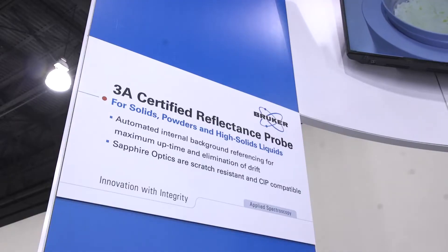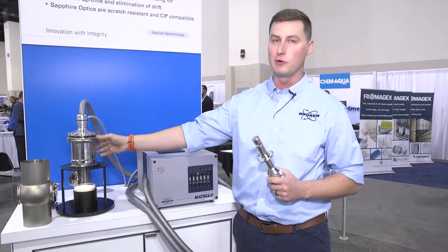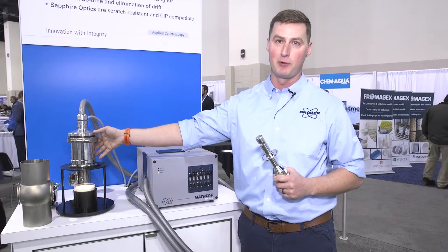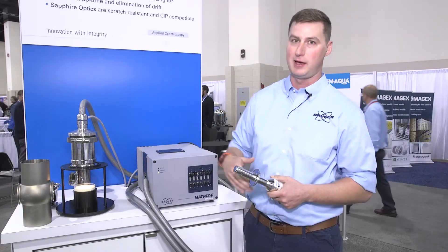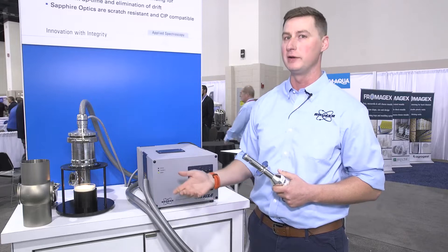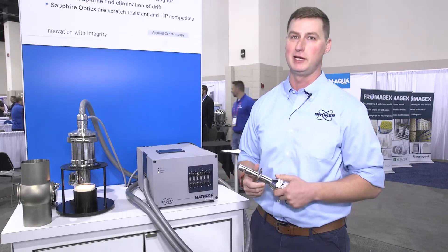Our transmission probes have two inch sanitary flanges, and depending on how we need to incorporate our emission head probe for cheese or powder analysis, we will either use a Varen line adapter or a weld-in flange option, depending on where in the process we need to go.